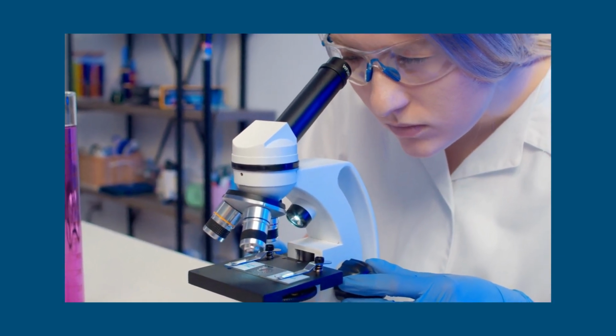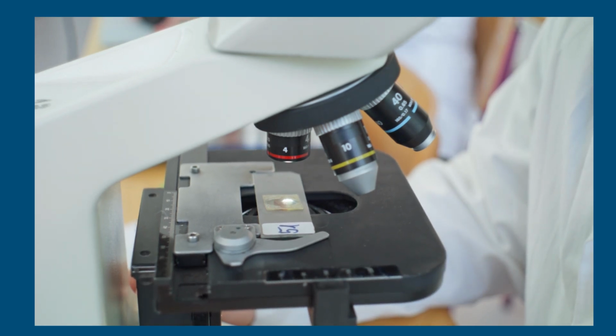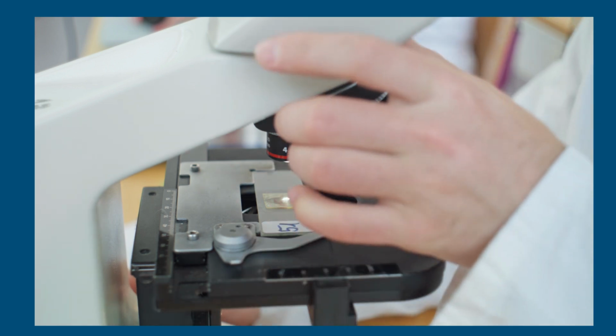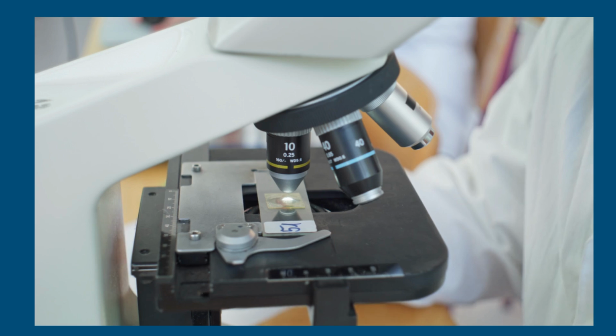These are the main objective lenses. Most school microscopes have 3 objective lenses. Low power ×4 for scanning. Medium power ×10 for general viewing. High power ×40 for super close detail.